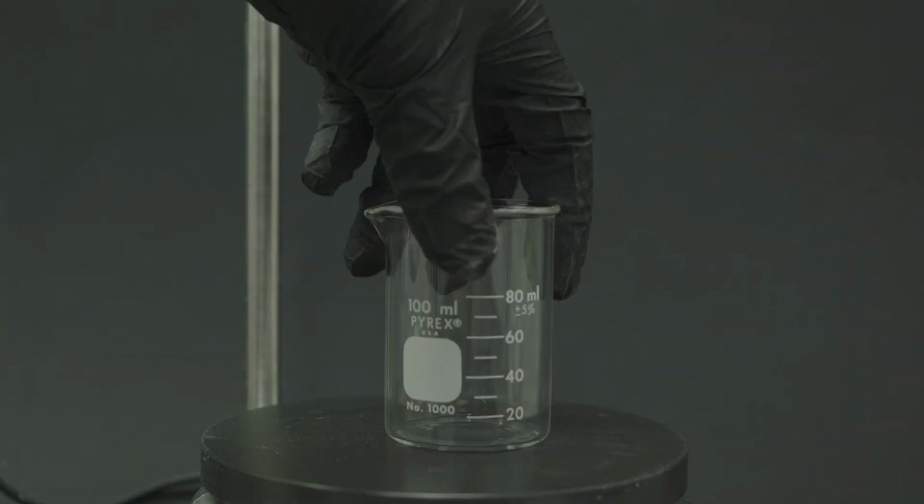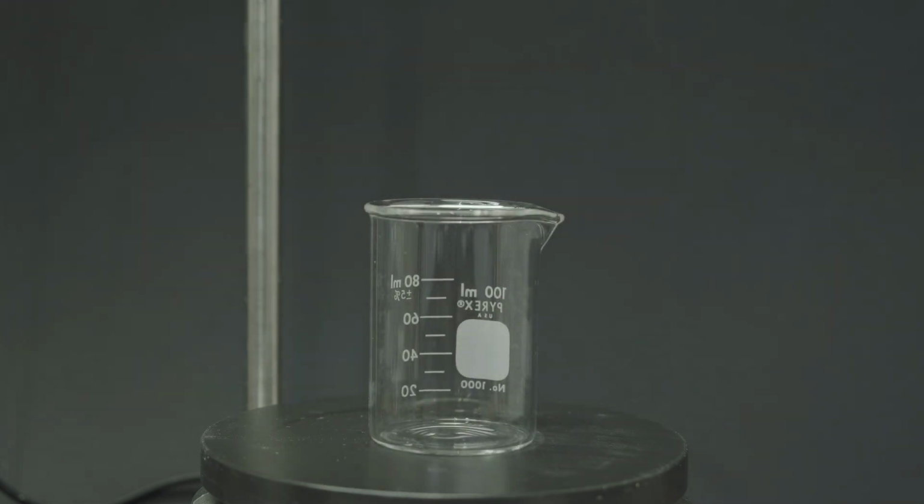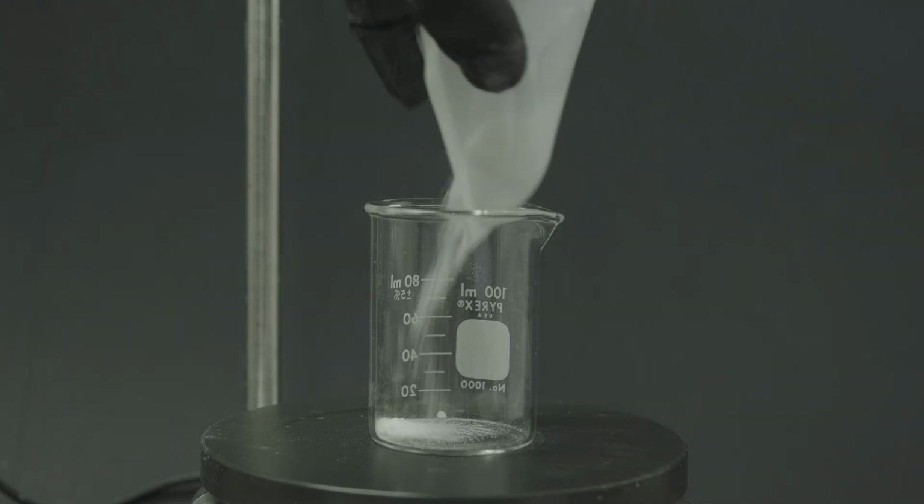So at this point, I was pretty sure that I hadn't actually made aspirin, and I was pretty sure that what I had made instead was actually nothing. I believe that what I had here was just salicylic acid that I had added into the reaction in the first place. This was pretty annoying because this was supposed to be a really straightforward, easy synthesis, but I knew that I had to try again because that would just be embarrassing.